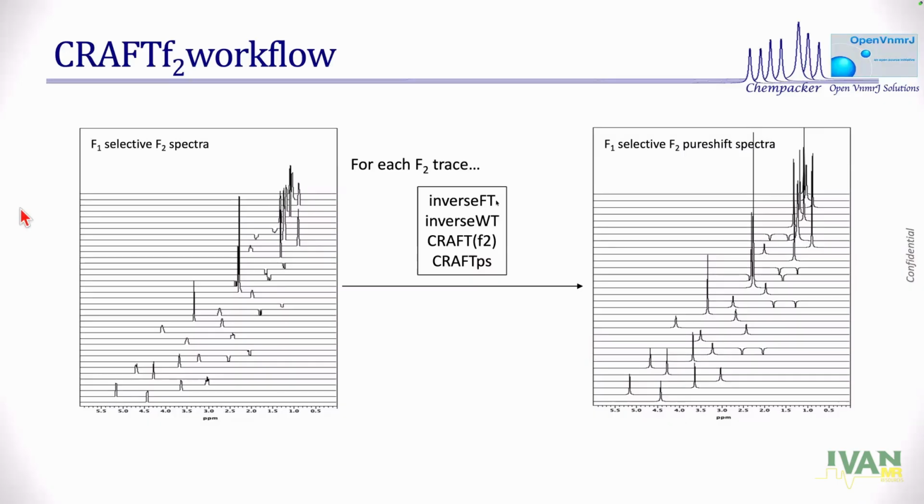So that apodization effect is embedded in that FID. But just like Fourier transform is reversible, the weighting function is reversible. If I know what weighting function, I reverse that. I multiply the other way, and then I remove that apodization function. Because I multiplied by an apodization function, now I take a division, if you may, multiply by the inverse of that: inverse FT, inverse WT.